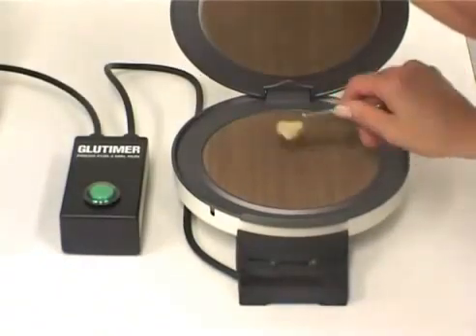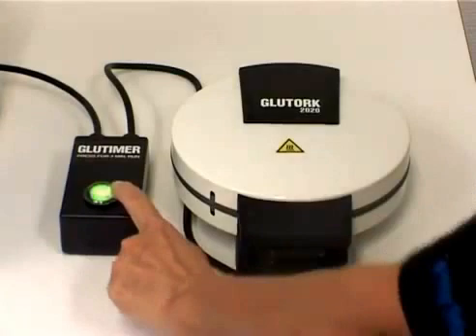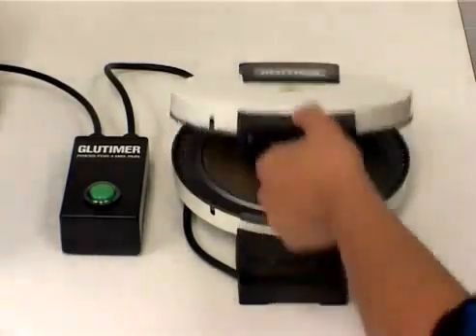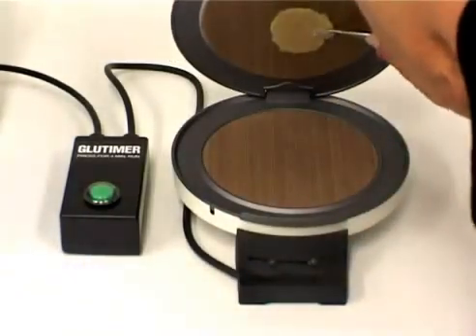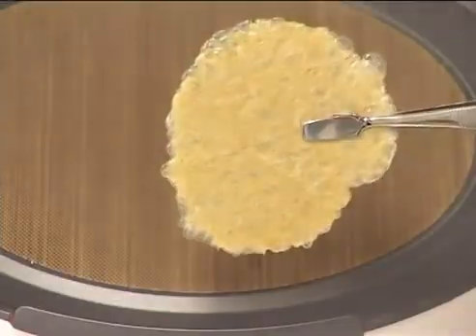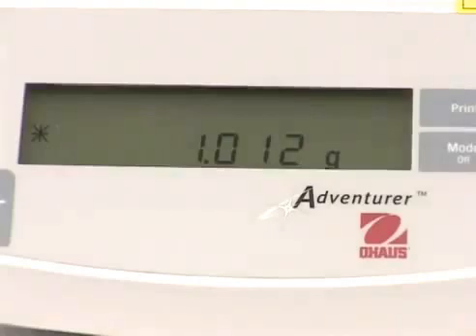After weighing, remove the whole sample from the scale, insert it into the glue torque dryer and start the timer. When the 4 minute drying time is up, open the glue torque and weigh the dried sample.